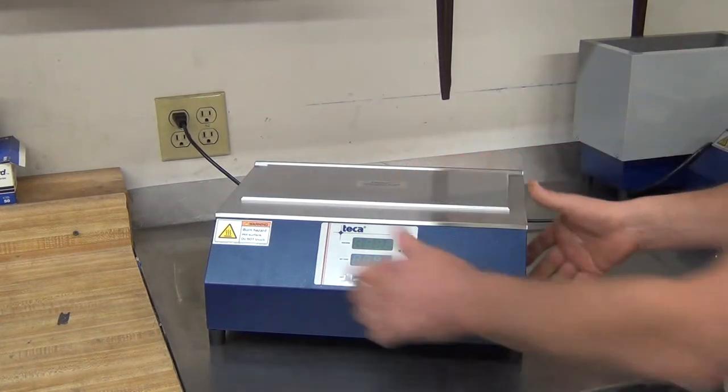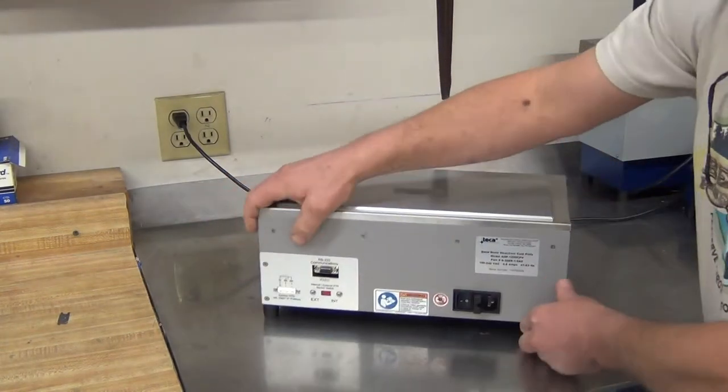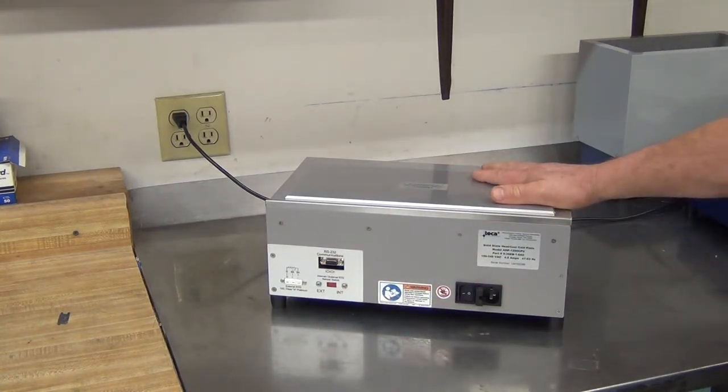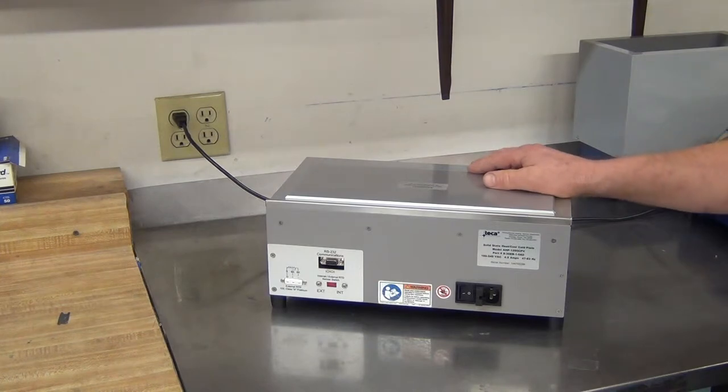Sensor is built into the cold plate or you can go to the back, hook up your RTD probe, flip the switch and now you have remote sensibility.